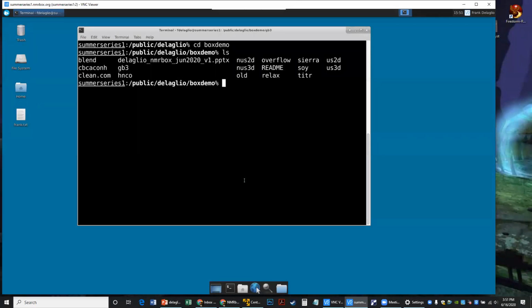Right. So the thing is, of course, if you do a regular Fourier transform, usually the individual planes themselves are not so informative or useful. So the thing to do, and this is built into the software, we'll see it, is that you do this inspection on the basis of projections of the result. And those are generally good enough to choose phase correction parameters.